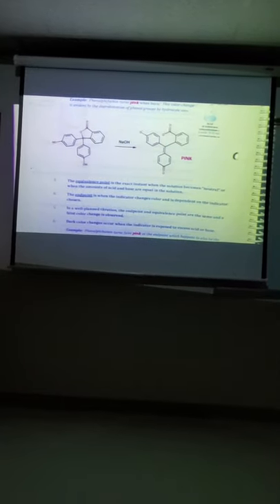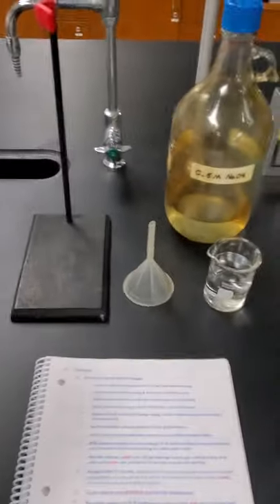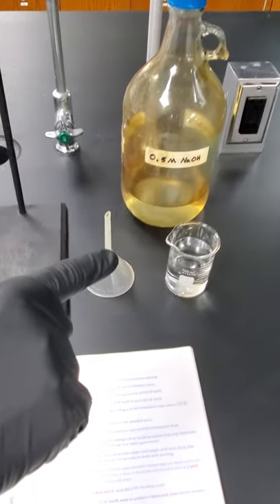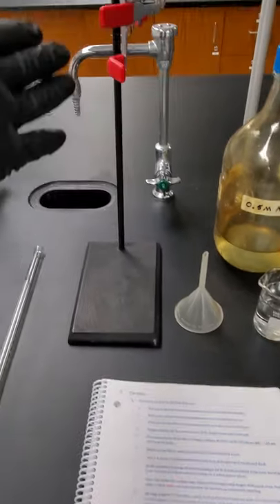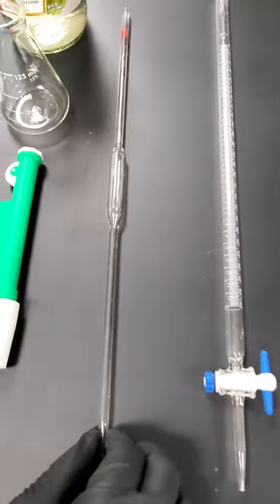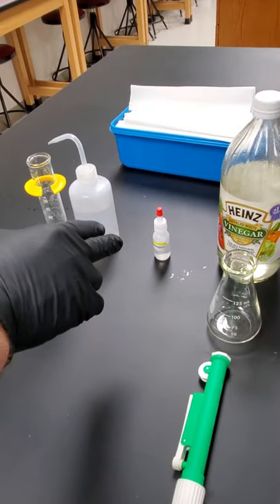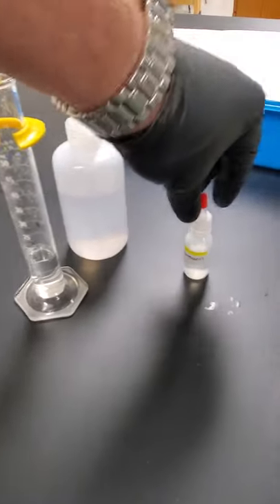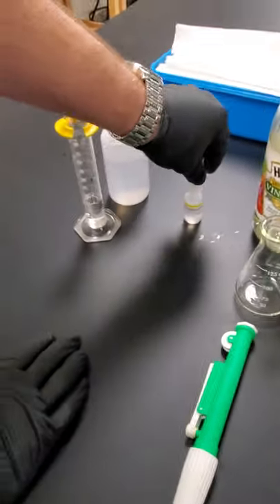Alright, so in lab, you can see our setup here. We have our base. I just transferred to a smaller container just like in our safety video. We have our funnel. We have our ring stand and burette clamp. We have our burette, our pipette, our pipette pump, Erlenmeyer flask with our vinegar, our phenolphthalein indicator, and then our water.